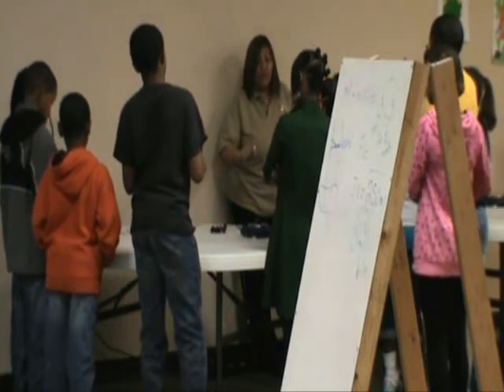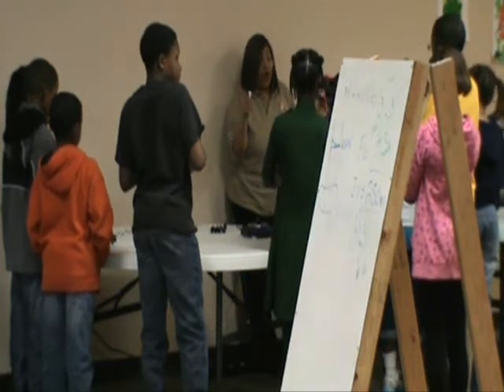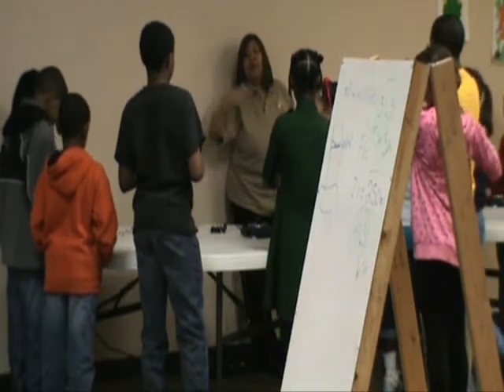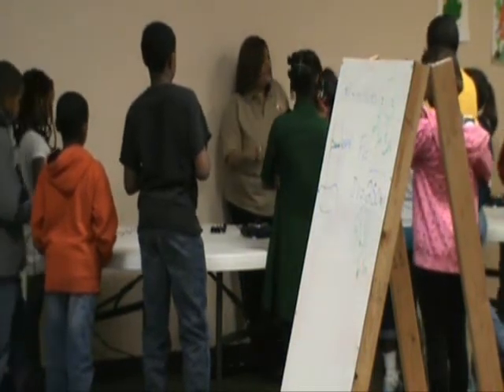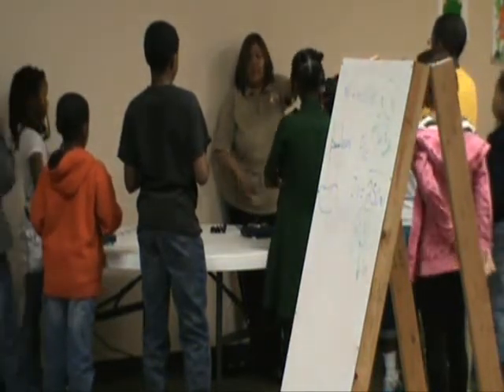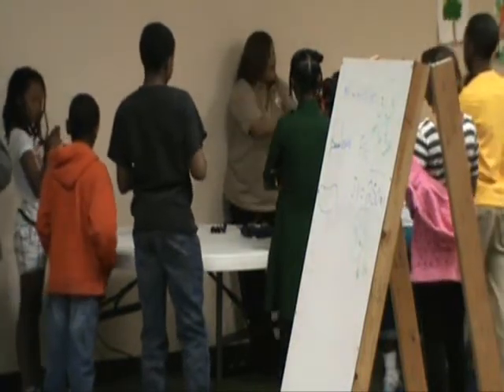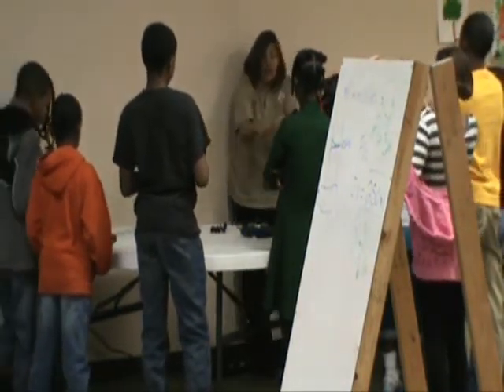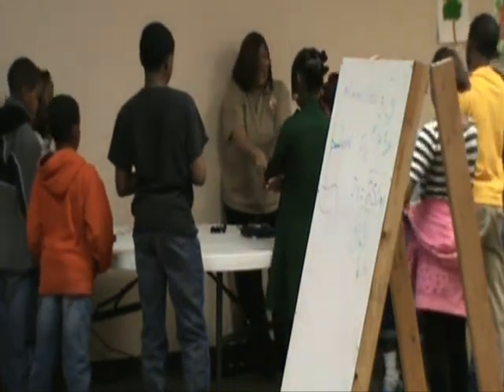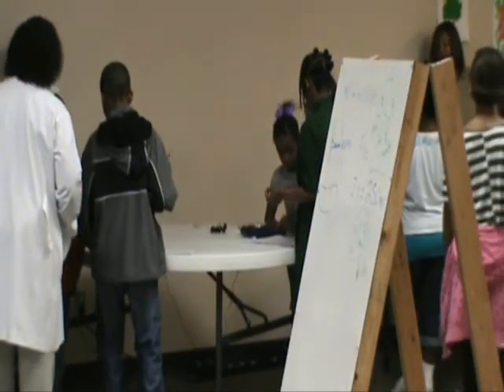After you get your value, you must do like real scientists do: go get your data sheet or remember it in your head because you're going to write it down immediately. Normally you would bring your data sheet with you. After you get that mass, do not pick it up. That's the same principle as taking the weight off of the manual balance. Return the riders back to zero. So when you get ready to pick this up, what should you do? Turn it off. And then what? Pick it up. 145.8. Remove your mass, and let's go determine the density.